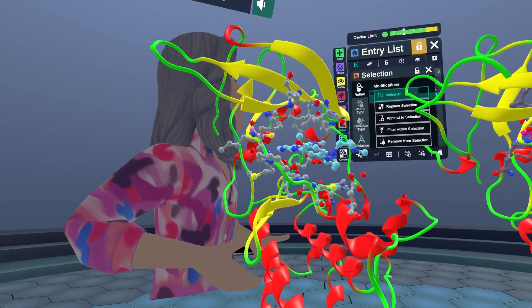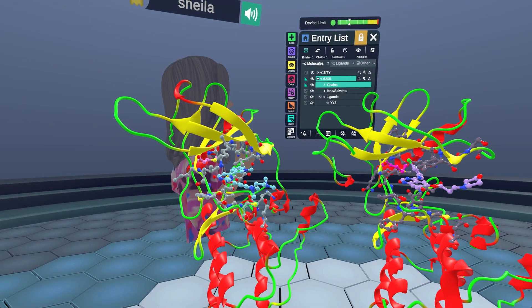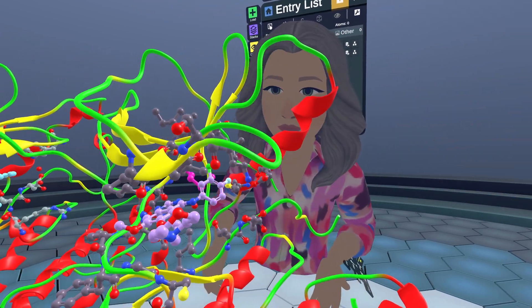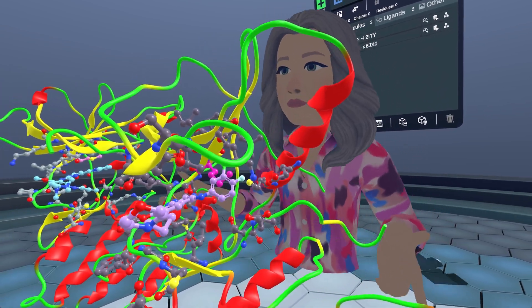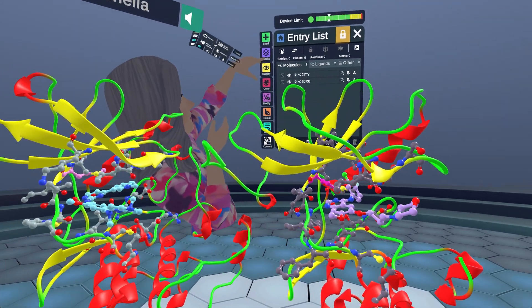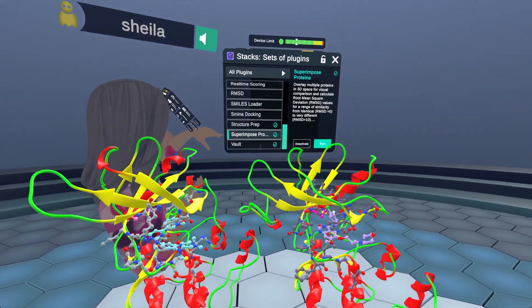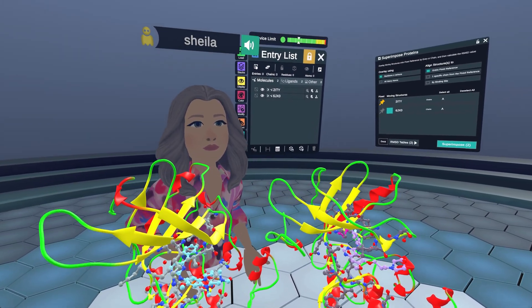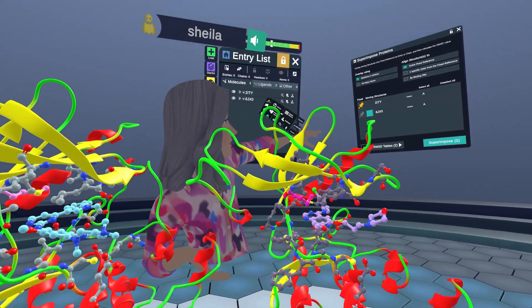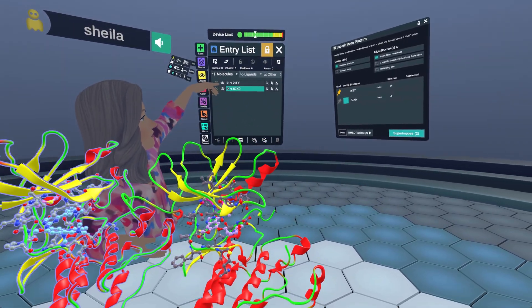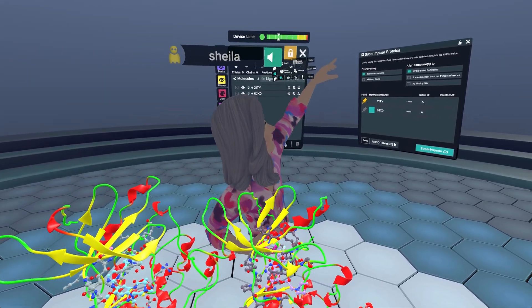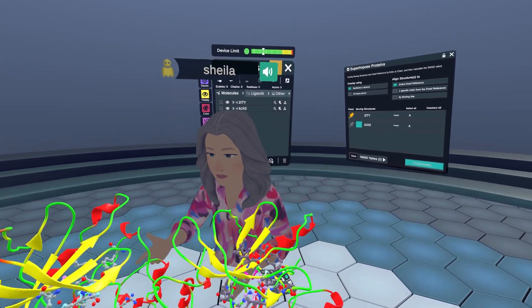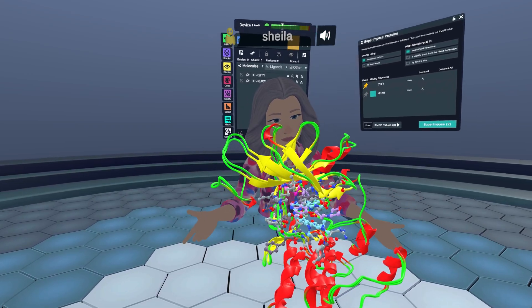Now that we have our model built for where we think that methionine might be, I want to show you how we can quickly superimpose these structures using our new superimpose plugin. We go to Stacks, Superimpose Proteins, and activate and run. When there are only two proteins in the space, there's a fixed protein and a moving structure already pre-populated. It comes pre-selected to run on backbone carbons, and all we have to do is click Superimpose.